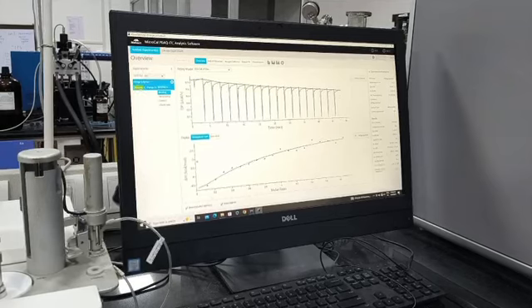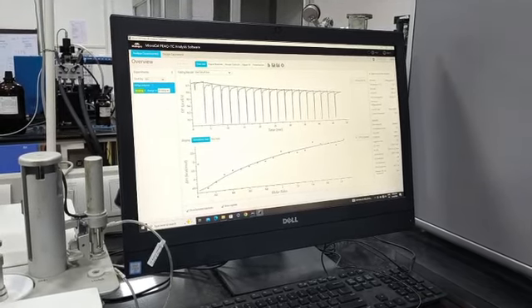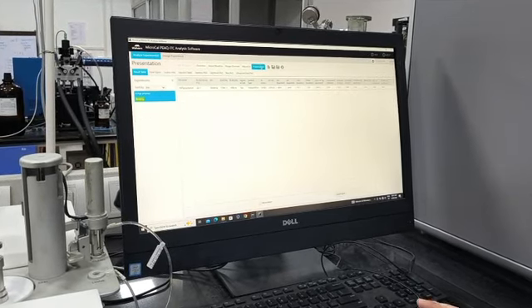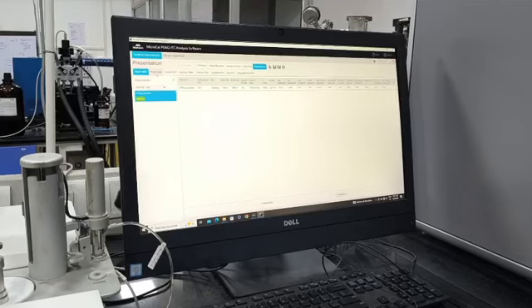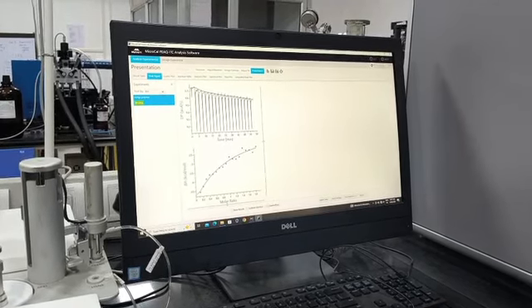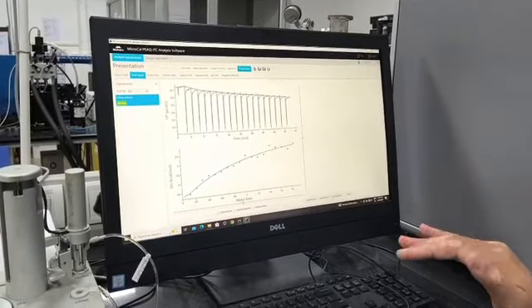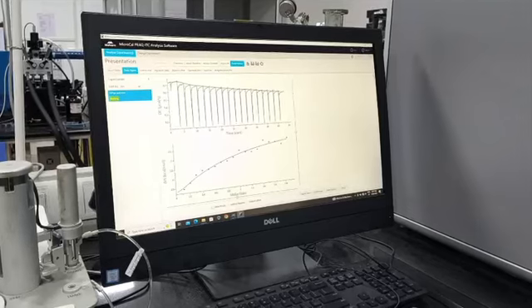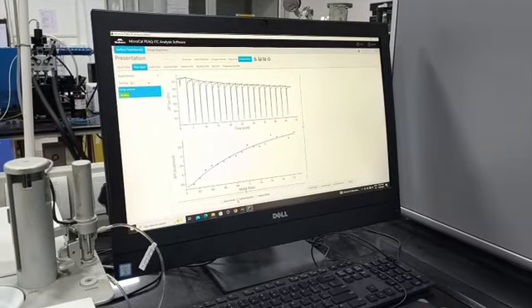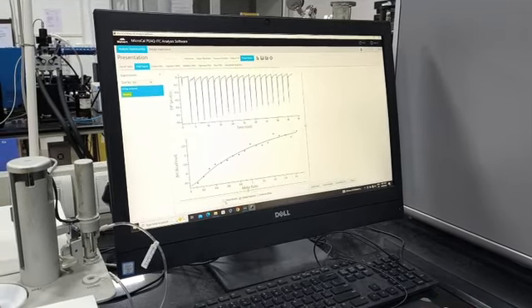Make sure this is in binding mode. Okay, point number 3, I'll go to presentation. Then come to final figure. Now, first thing first, you have a graph. You can see this baseline is not correct, it is somewhat distorted, so it will say subtract baseline from below. Right, now show results.